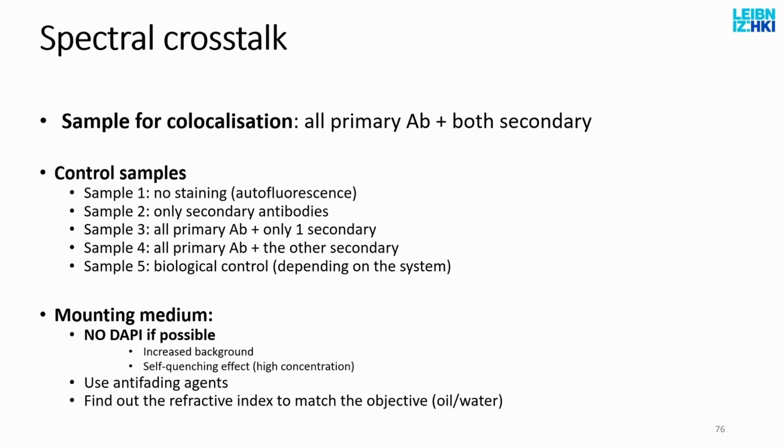On the other hand, if the sample is stuck to the cover slip, it's a monolayer of cells. I go from glass to glass to the cells right away, and I put oil there, because I'm not traveling in the sample more than a few microns.